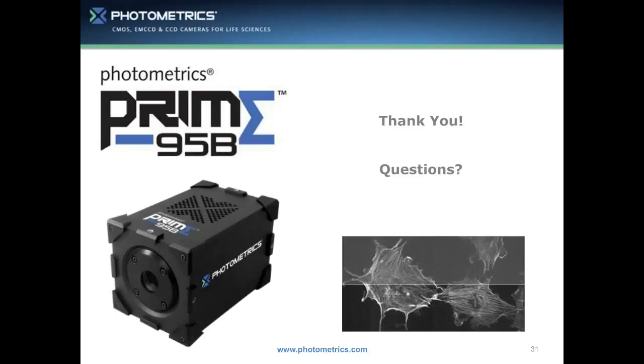Does the Prime 95B back illuminated have enhanced function too? I would keep your ear out for that actually. At this time it does not, but being based on the Prime platform of cameras from Photometrics, it's definitely something to keep an eye out for in the future.